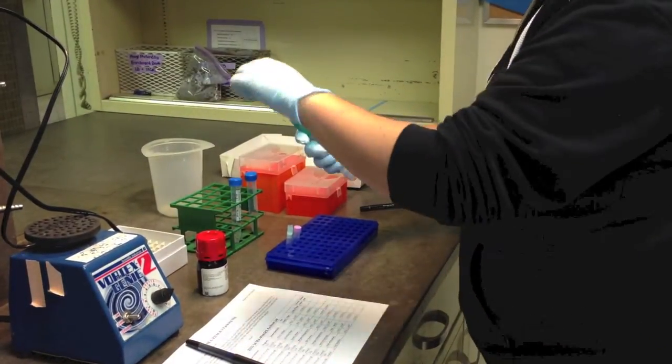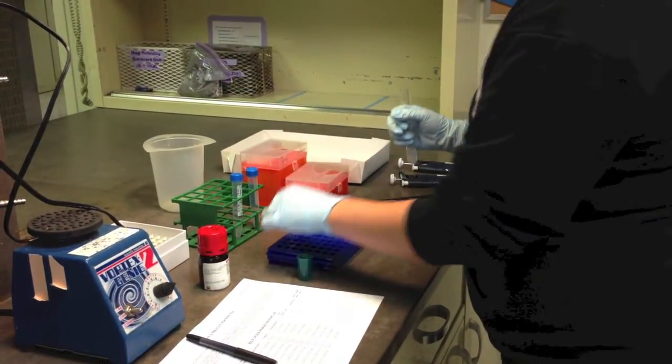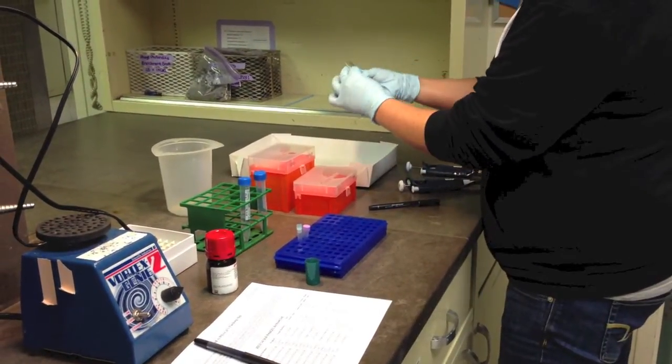Next, you will fill each tube, using aseptic technique of course, with sterile beads to about one centimeter from the top of the tube.